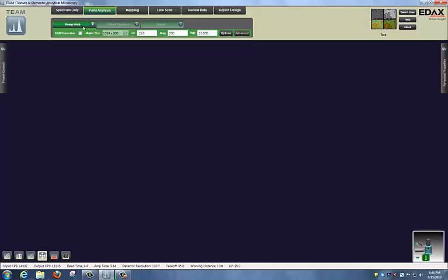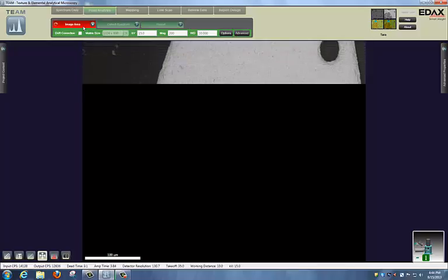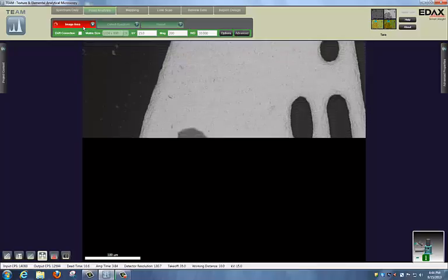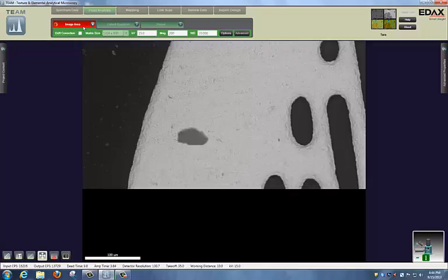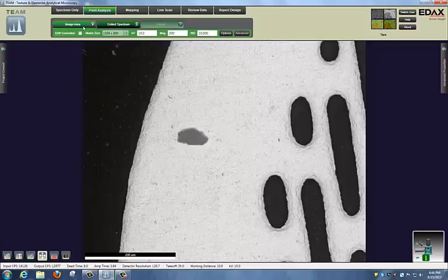I'll click on the Image Area button, and it's going to start the acquisition. Any of the functions start when you click on the green button. When it's indicated as red, it means it's active in performing that function. At the end, you saw that it had a contrast adjustment, which gives us the nicest looking image that we can have based on the intensity of the histogram that's located behind the scenes.